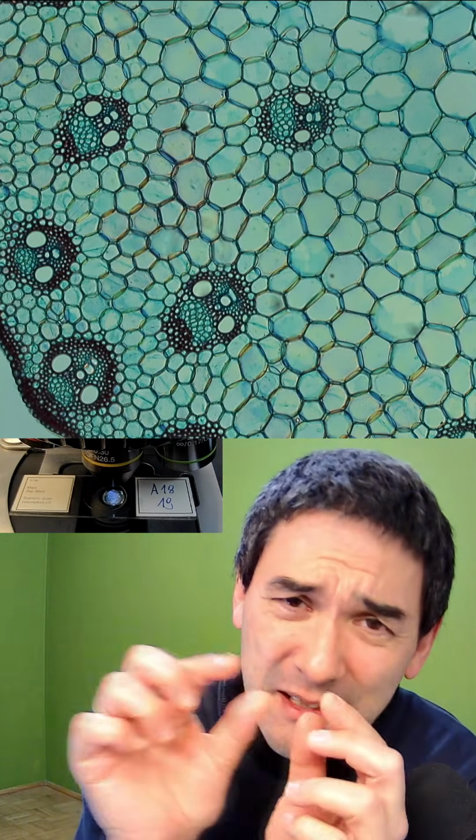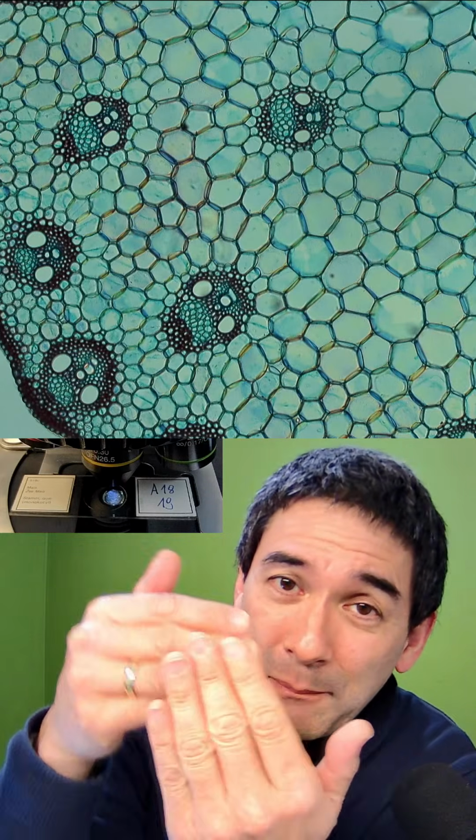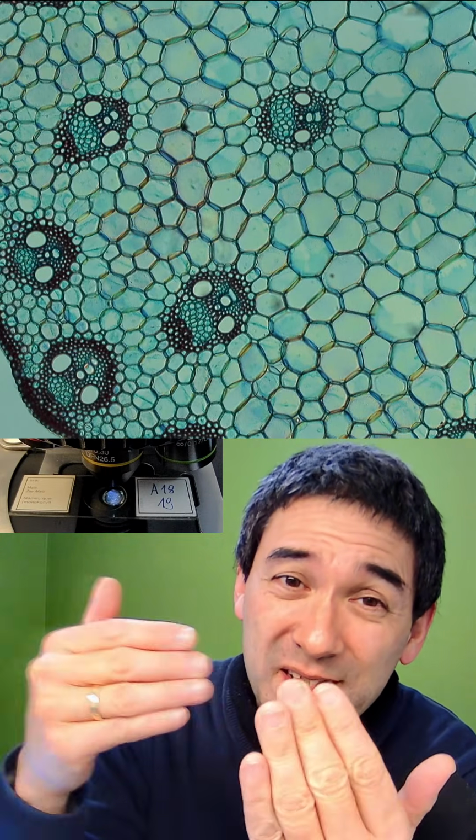The webcams at that time had 640 by 480, so tiny. The resolution was miserable. However, I got very good results because I took hundreds of overlapping pictures and stitched them together. This is why I got very nice pictures of those slides.